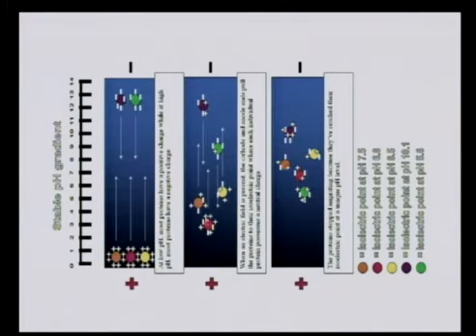The middle picture shows what happens when you allow the current to go through the IEF strip. You can see the positive ions moving from the anode side towards the cathode, whereas the negative ions from the top are moving down. These arrows show the movement of the ions in opposite directions from their native places.